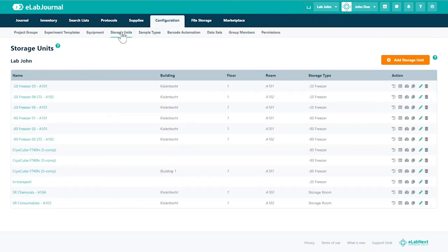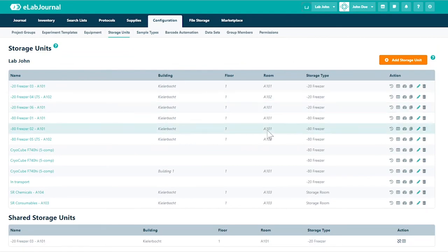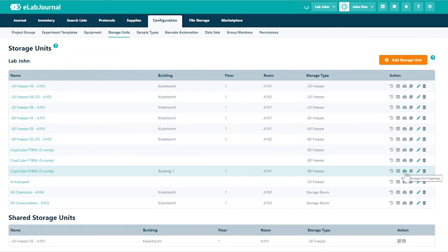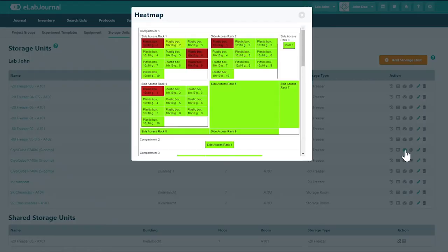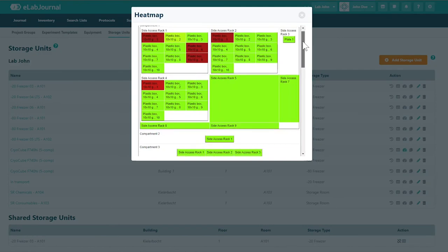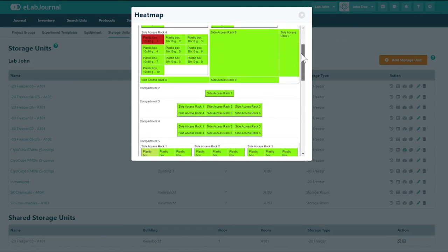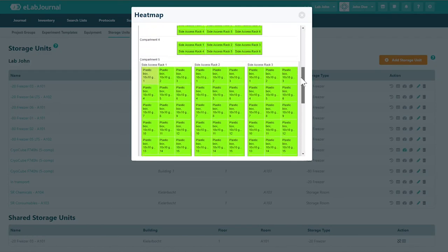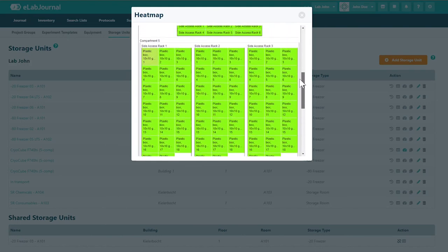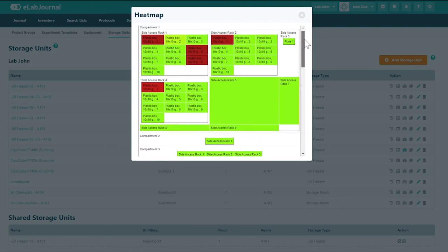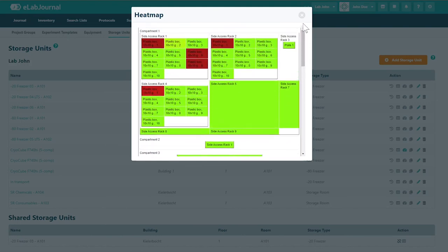Next you can view a heat map of the storage unit space. The heat map provides a clear representation of the available storage capacity of each location indicated by a coloring. The color spectrum is from green to red, where red means that the selected location is full.